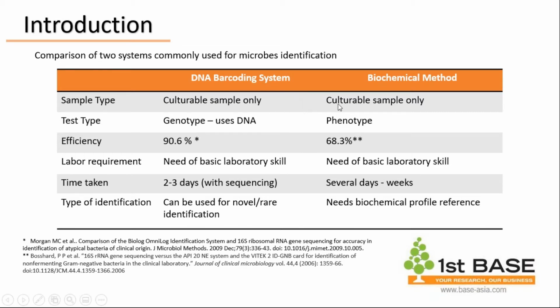For both systems, it is important that the microbe must be culturable, and it should be a pure single isolate. Then what you need is only basic laboratory skill to carry out these two methods, and the time needed is quite short.